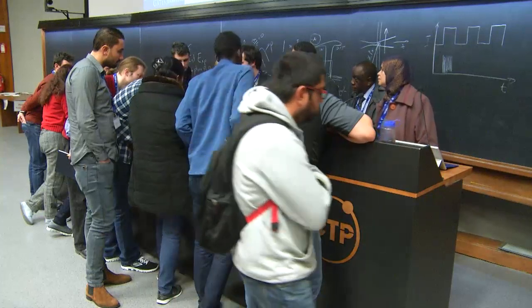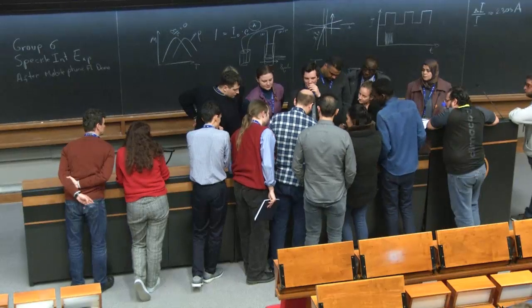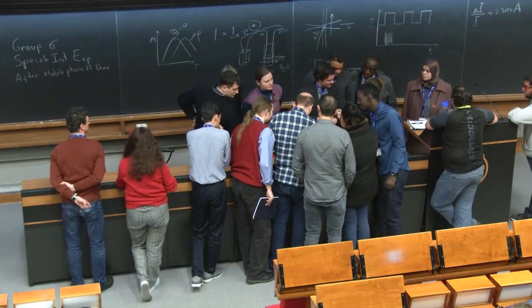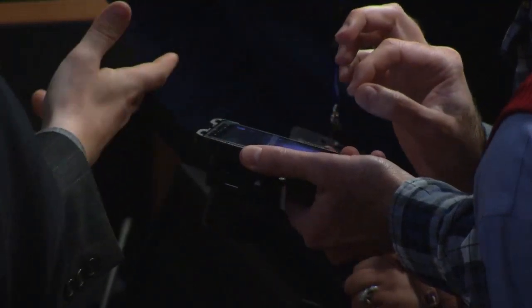So you can, if you'd like, just play around and insert any samples you want. There's frog tongues and other embryos and vertebrae in here. One thing with this, the application doesn't allow you to zoom in beyond like this, but if you take a picture, you can zoom in further if you go to the photos in the phone. It's limited.